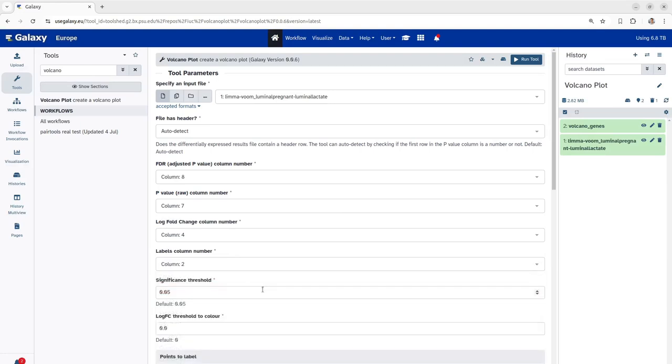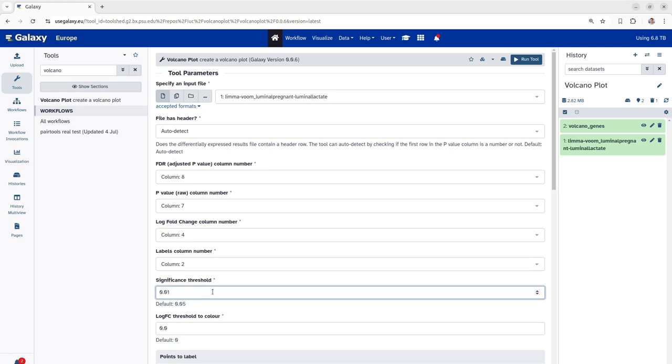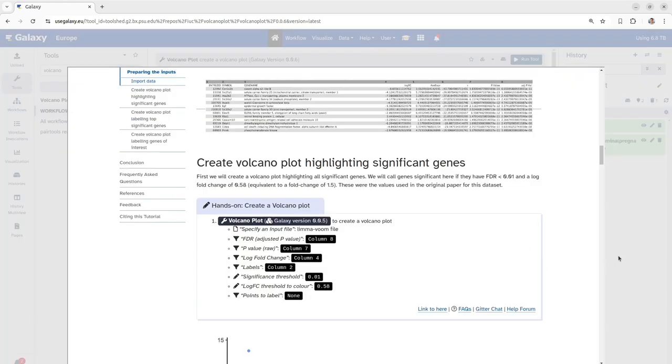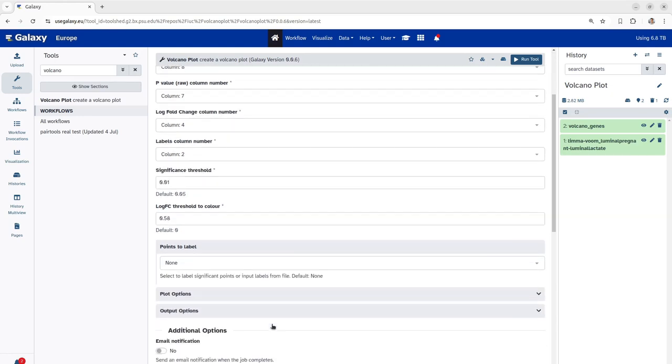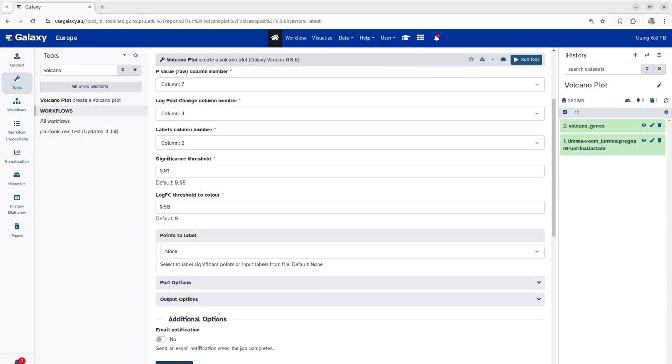Next, we have to specify the significance threshold and log fold change threshold to color. As per the study, the significance threshold for this paper was specified as 0.01 but could also vary depending upon your research question or analysis criteria. Next, we also have to specify the log fold change threshold. So, the log fold threshold values we change from 0.0 to 0.58 here as per the tutorial and further proceed with running of this tool.